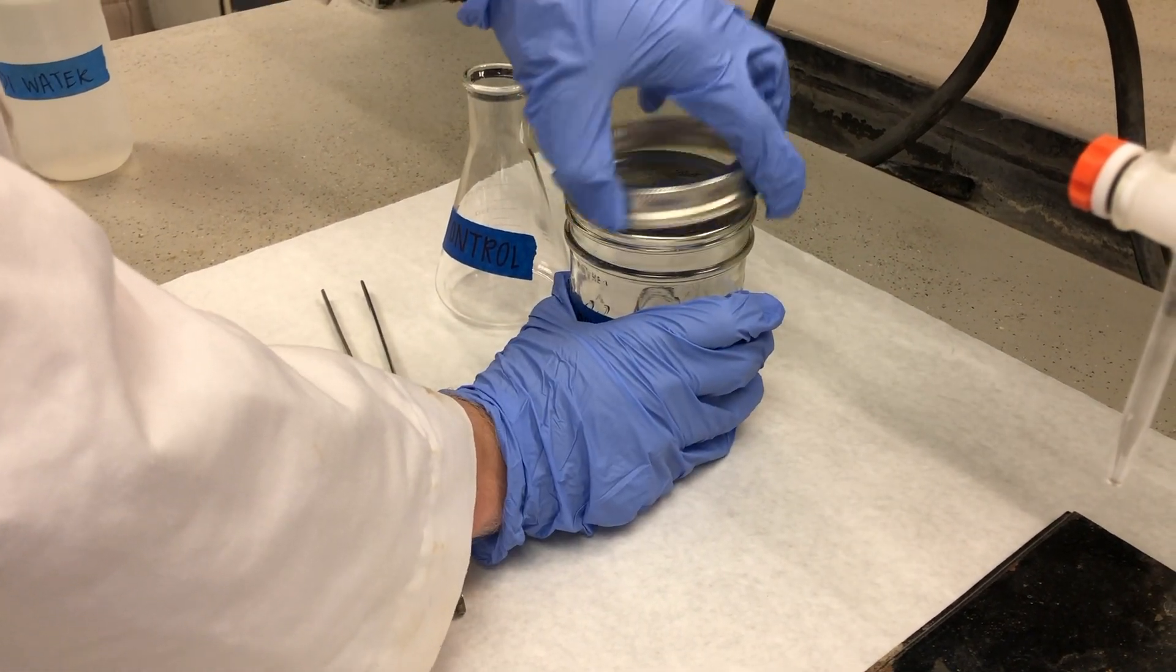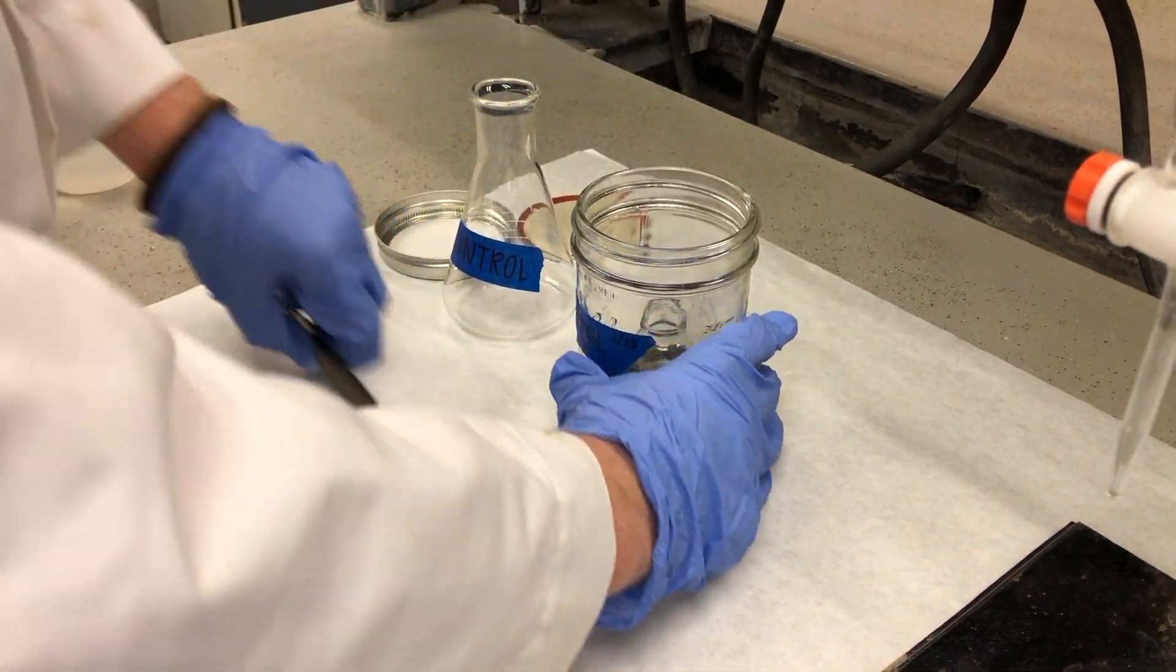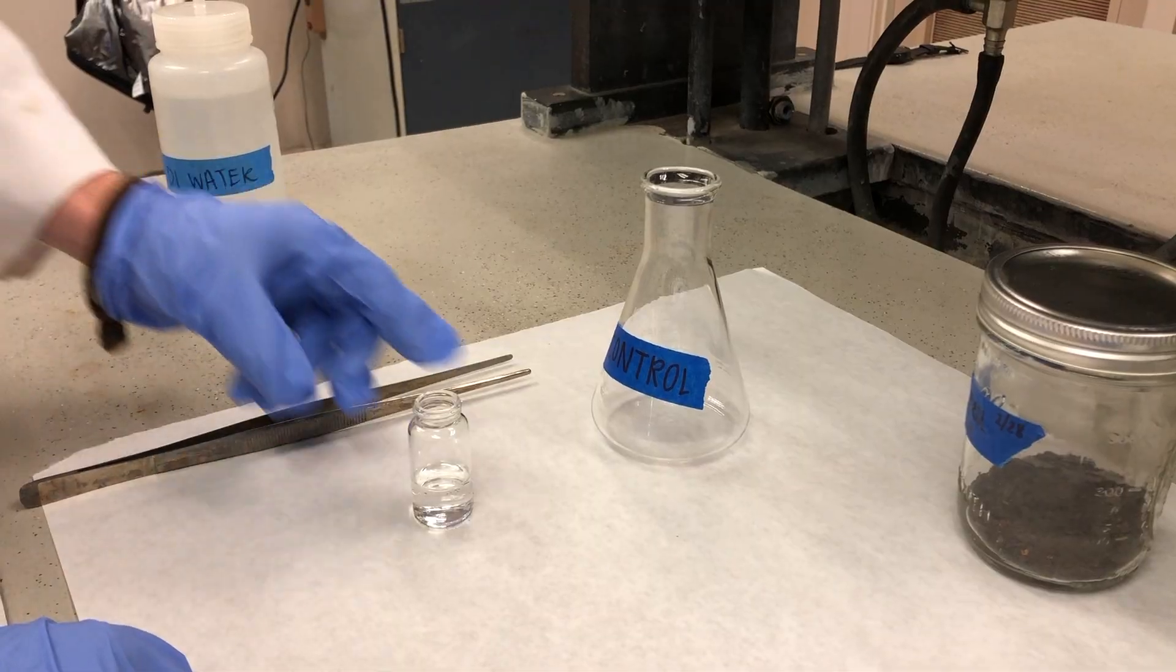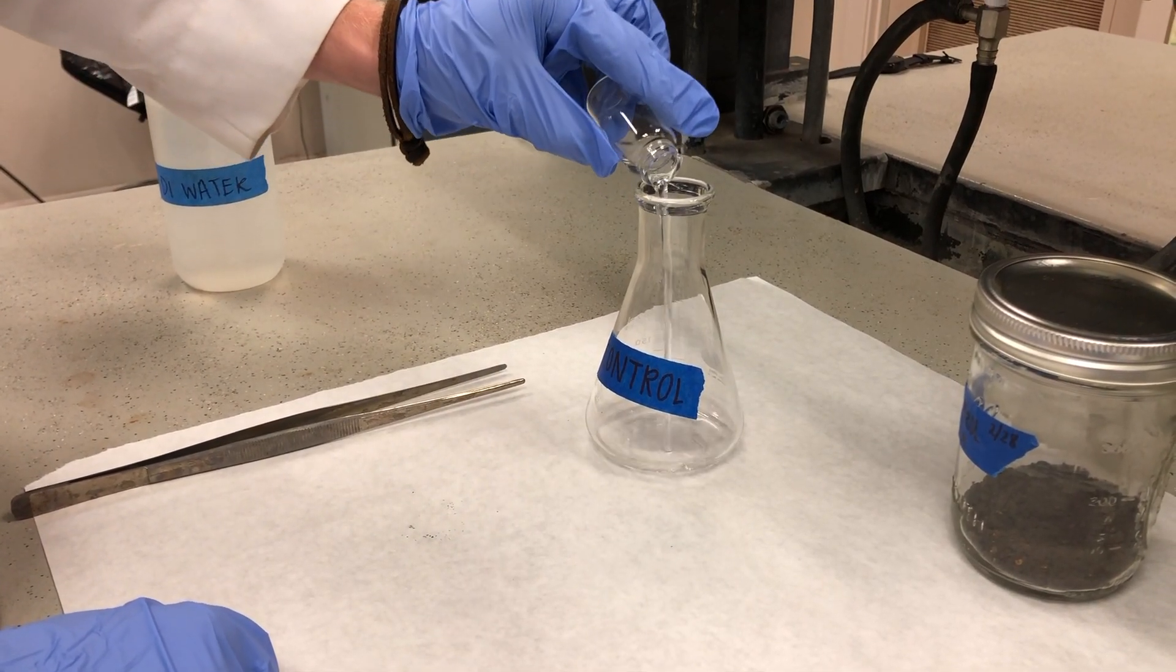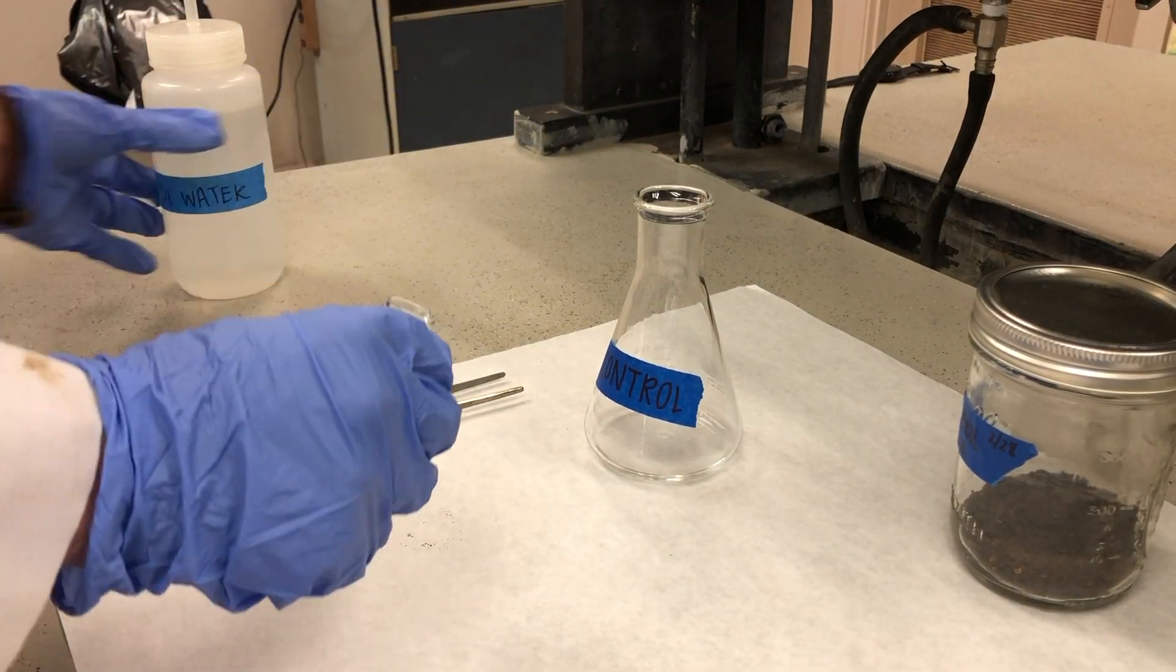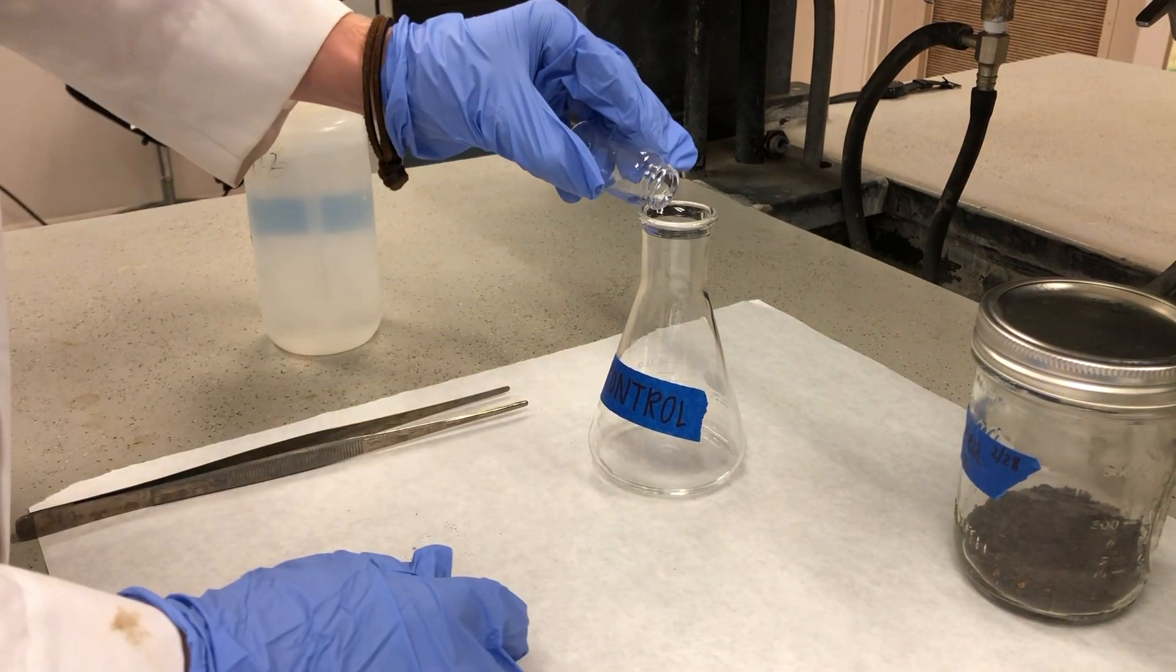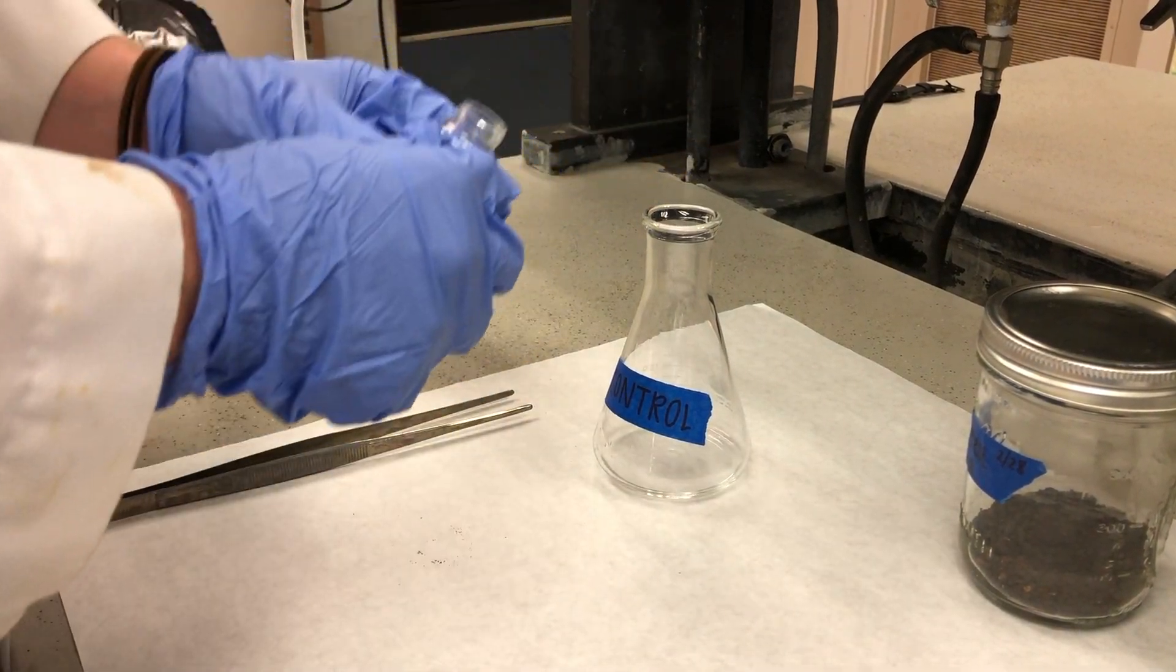Carefully remove the alkaline traps from the incubation jars using tweezers and pour the contents into the corresponding flask. Next, rinse the vial with deionized water into the flask to flush out all remaining NaOH. The amount of water used in this step is negligible. Repeat the process for each jar.